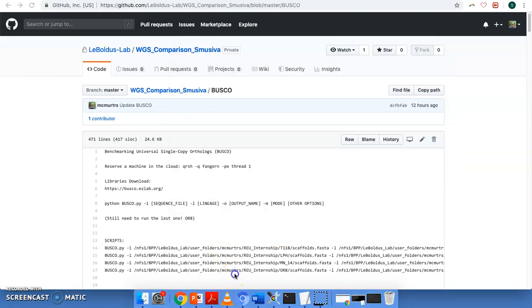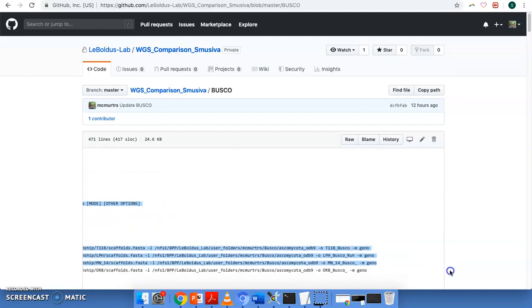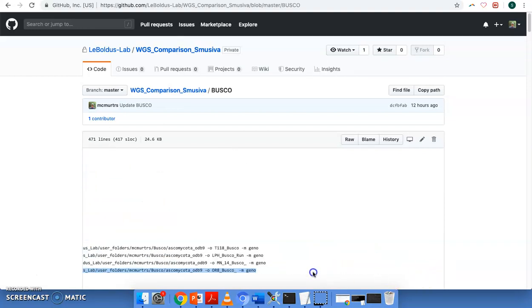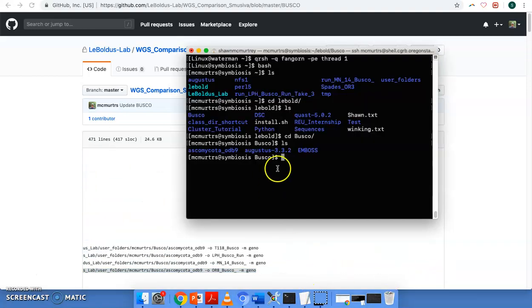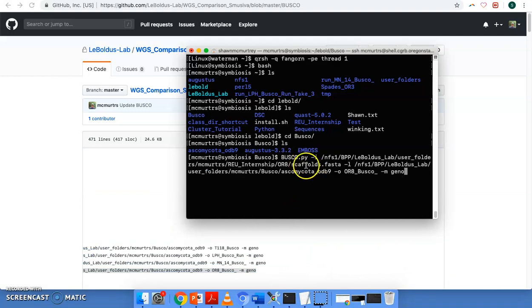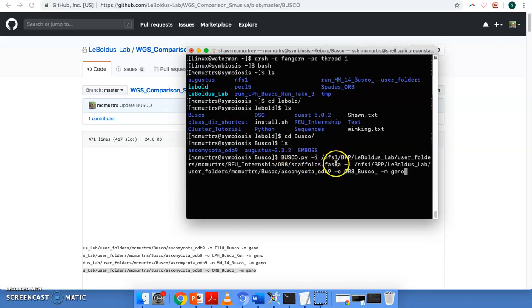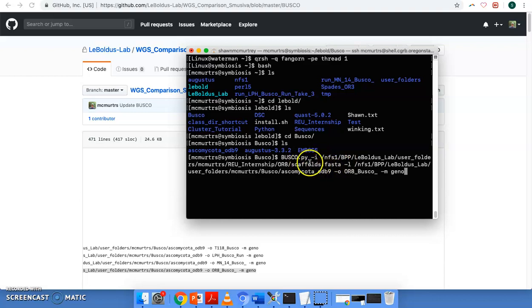So let's go ahead and here's the script that's written out previously. We'll copy it. And I'll paste it and then I'll explain what it does. So busco.py, that's the Python code, dash I, this is our scaffolds. This is our genome file here and the path to that.